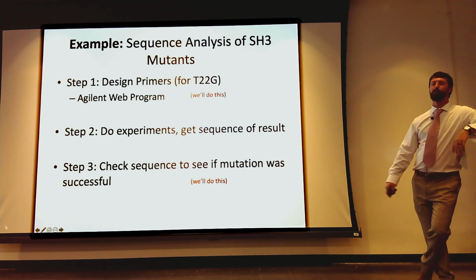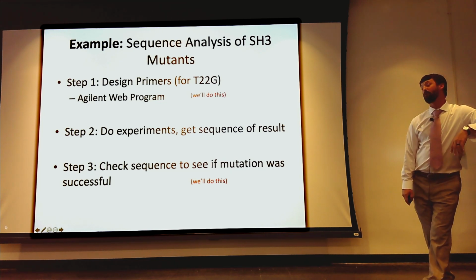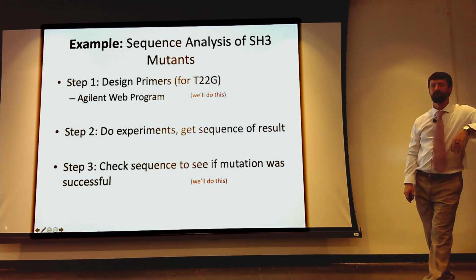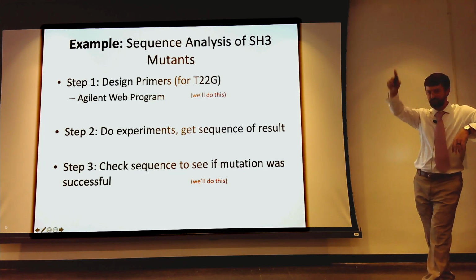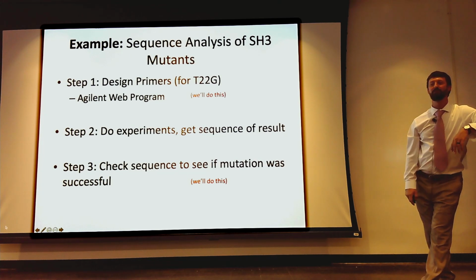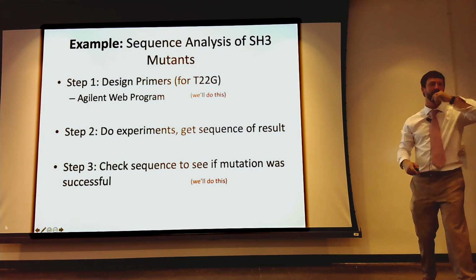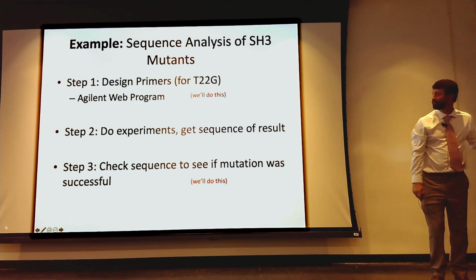But long story short, most days you take your plasmid, you take a small amount, you put it in a tube, you send a primer out, and a company actually comes back and gives you a different set of reads, right? And based on the color and the absorbance, and please always check the chromatogram for your sequencing. Look at it, make sure you have a clean peak for each nucleotide there, right? Each one's usually in a different color. Sometimes you can get equal size peaks, right? And make sure the sequence is verified.